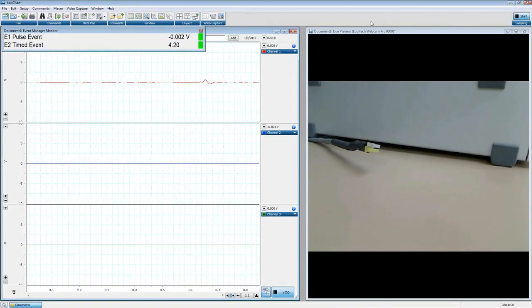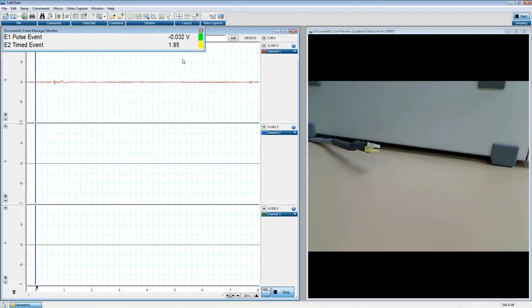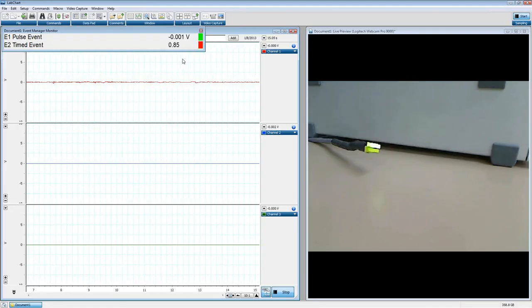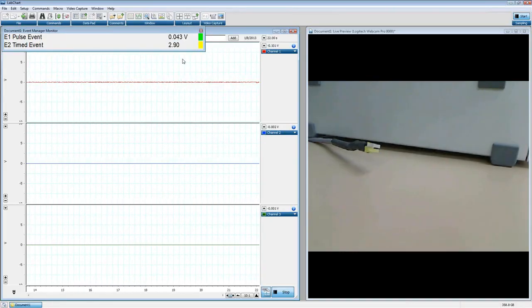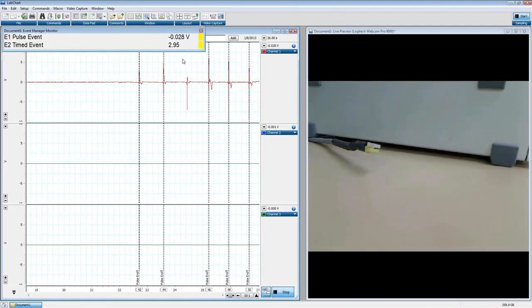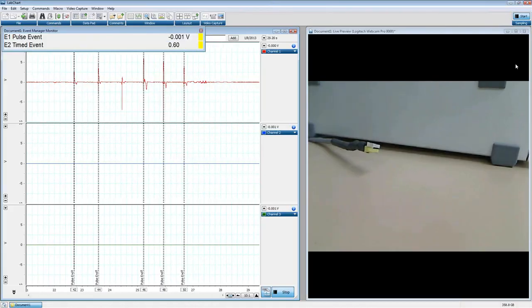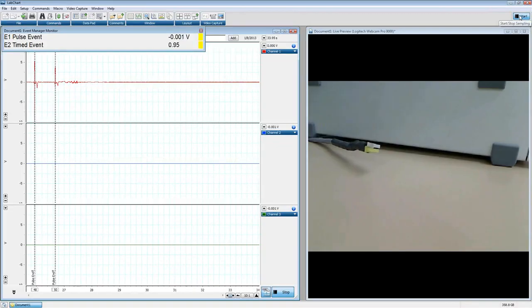We hit start. Let's go ahead and make that a little bit smaller for us. Our timed event occurred. We went past 5 seconds, then turned off after a second. Turned off, turned on. And you can see our light corresponds to it. Light on, turned on. And we can also match with our other. And now our light keeps turning off and on.